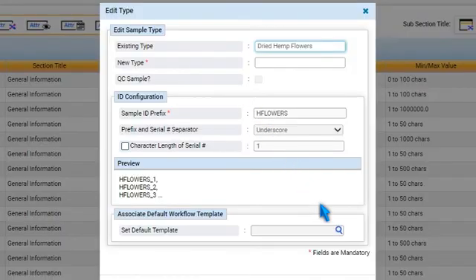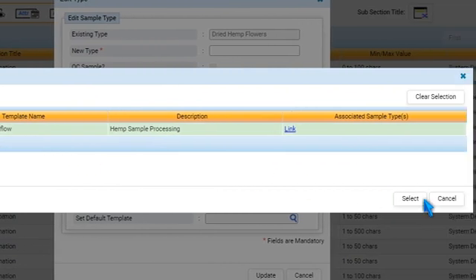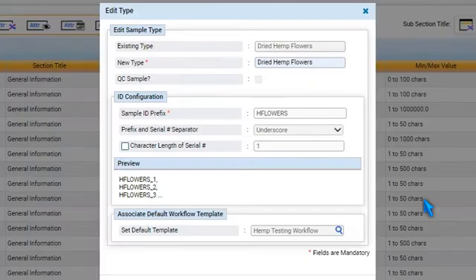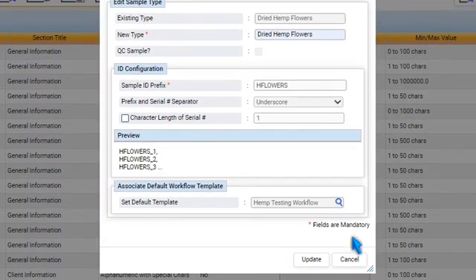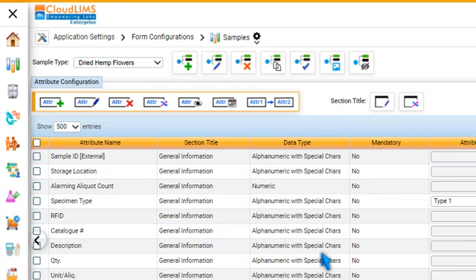To set a workflow template as a default for a sample type, select the sample type and click Edit Type. Now, press Browse, select a template, press Select, and then Update. Similarly, you can also associate a workflow template while adding a new sample type.